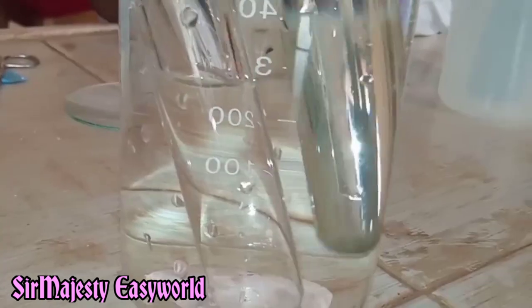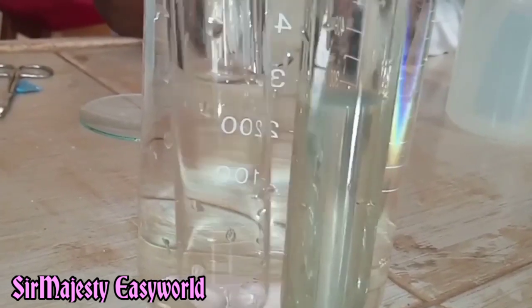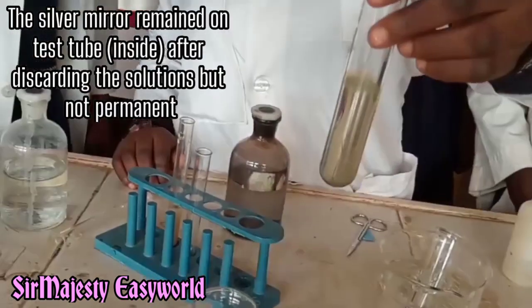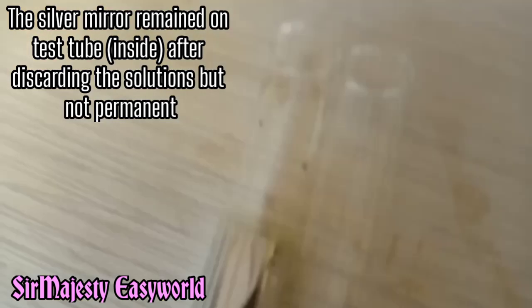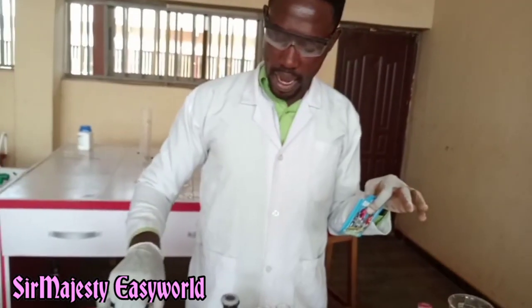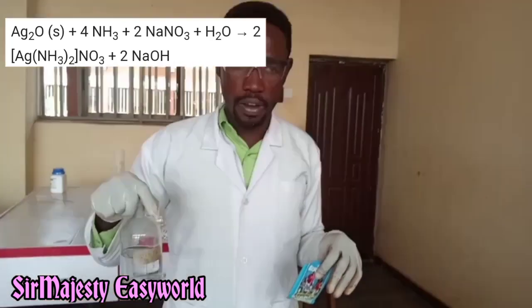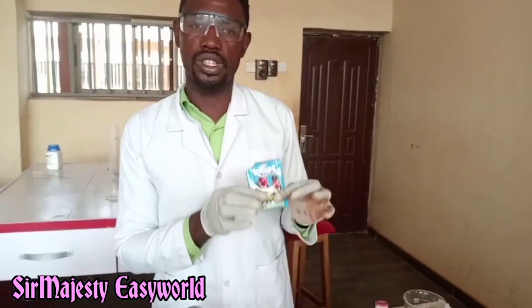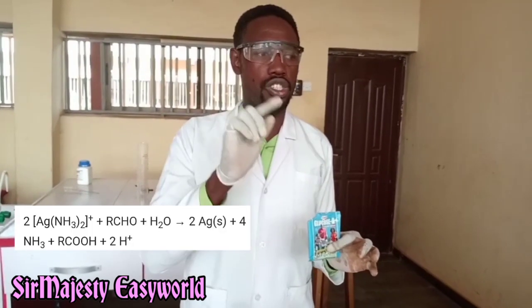What you saw behind the preparation of Tollens' reagent is that I first added silver nitrate, then followed by addition of sodium hydroxide to each of them. There is formation of black precipitates of silver oxide. Then I added the aqueous ammonia and the silver oxide dissolved, forming a complex ion known as the diamine silver(I) ion. And that complex ion is what reacted with this reducing sugar. The silver ion in that complex — which was clear — was reduced to silver metal, from Ag⁺ to Ag⁰.